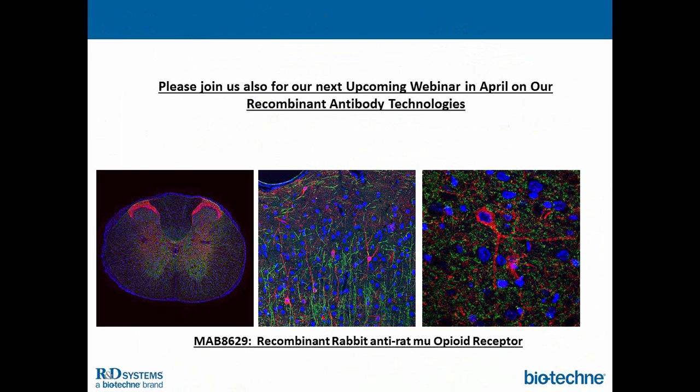Thank you, Anders. Actually, I have a question from watching the webinar. If, say, the application is only for something like Western Blot, what are the ways that you can determine the specificity of that antibody to make sure that you're really picking up the signal that you want to pick up? Mm-hmm. Yeah, that's one of the open questions we get a lot of times. So if you only have a Western Blot as the only test that you're either able to test or that's the only one that actually gives you a result, you can start with the inductions on cell lines if you're after a phosphorylated target, as I've shown.